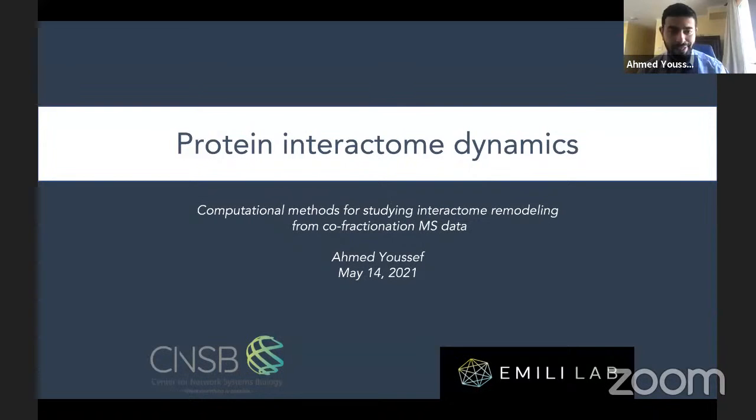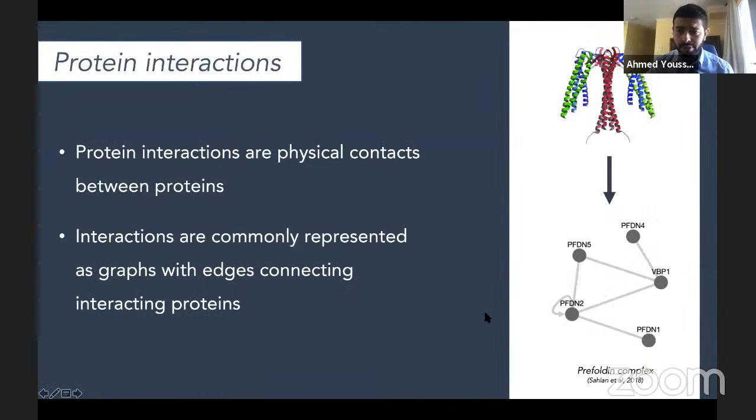So, as this title slide suggests, my research is interested in protein interactome dynamics, and today I'll be talking a bit about some of my ongoing work in developing computational methods for studying interactome dynamics from co-fractionation MS data. So first, I just wanted to give a brief introduction.